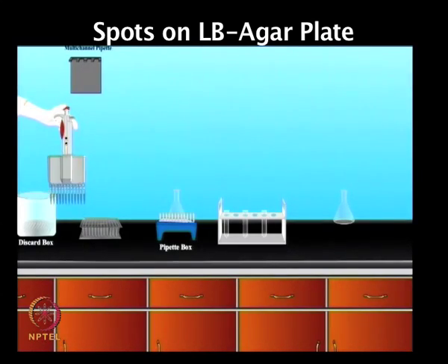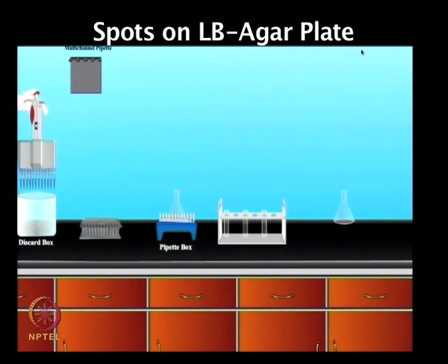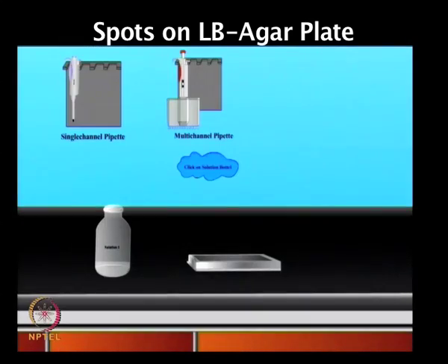Remove the supernatant from these bacterial cultures. Discard the tips, and once you have completed that for all the wells, you are ready to perform the DNA plasmid isolation.